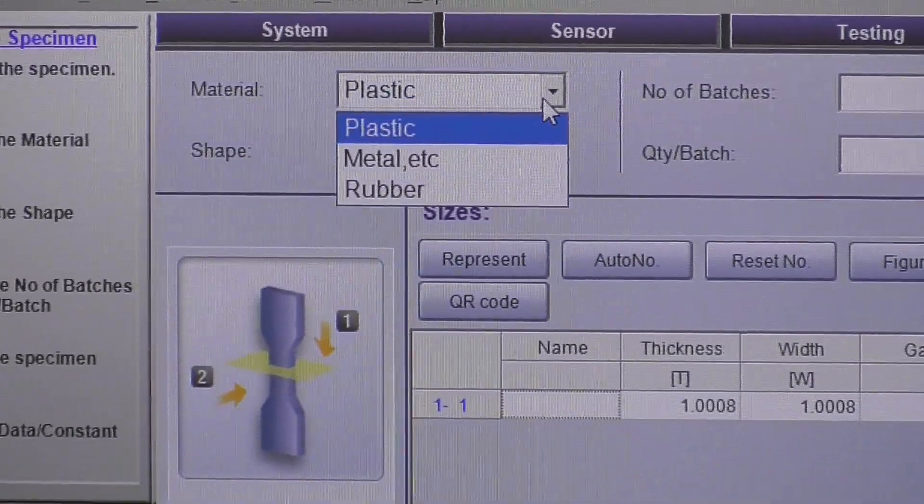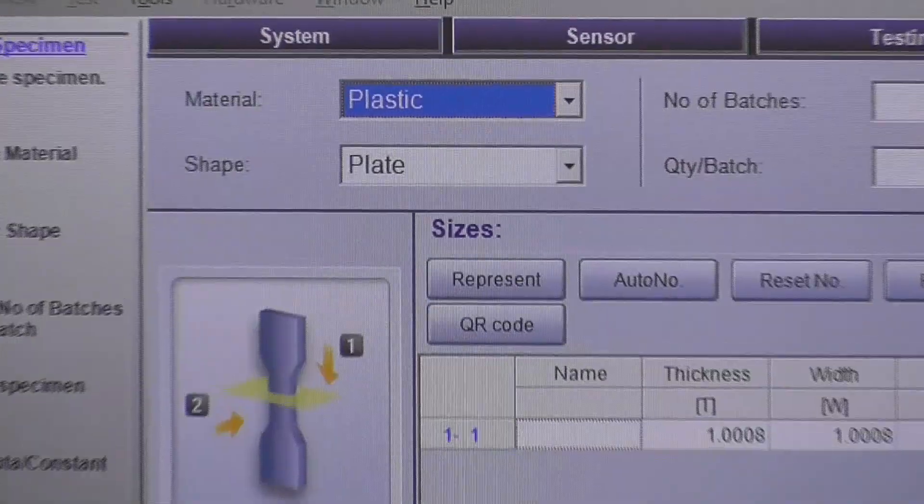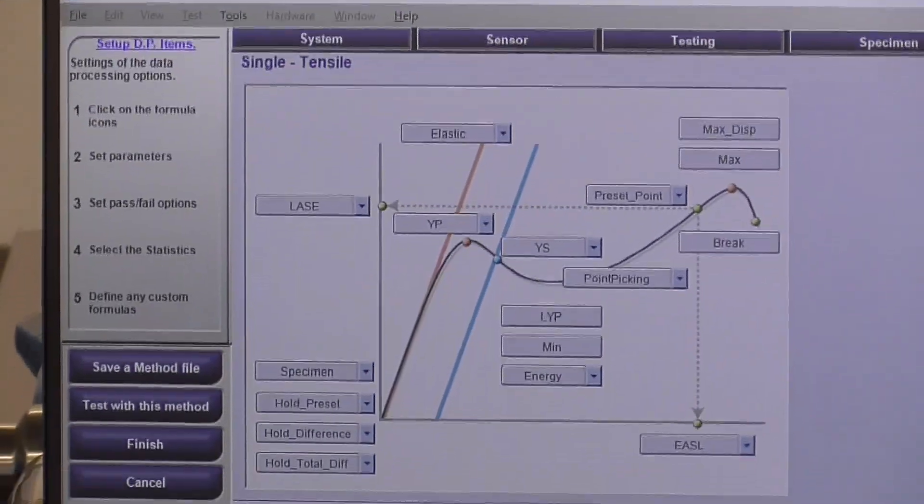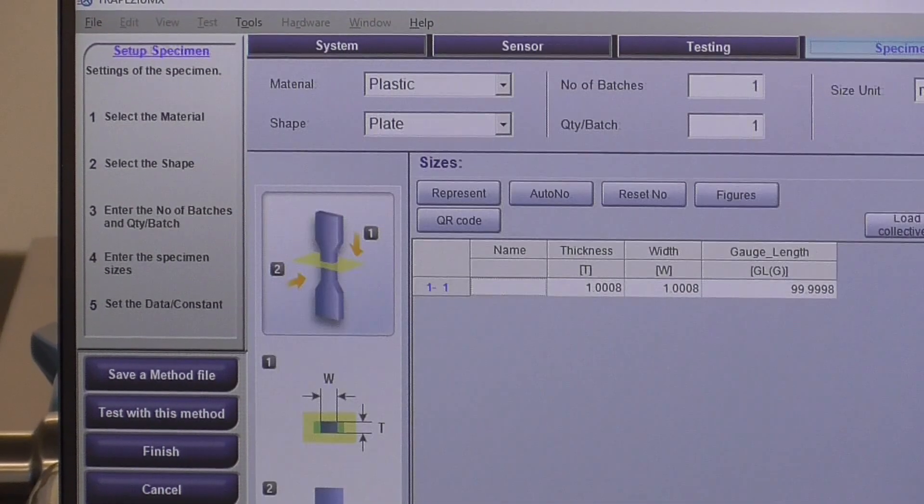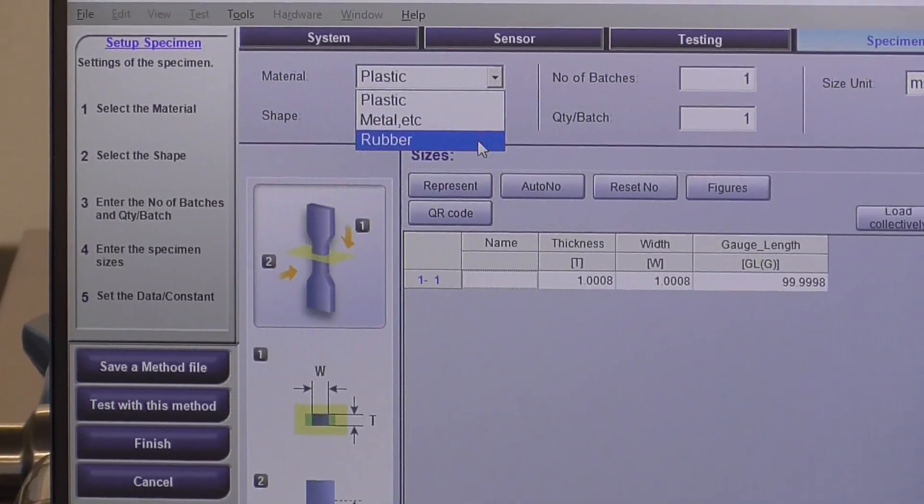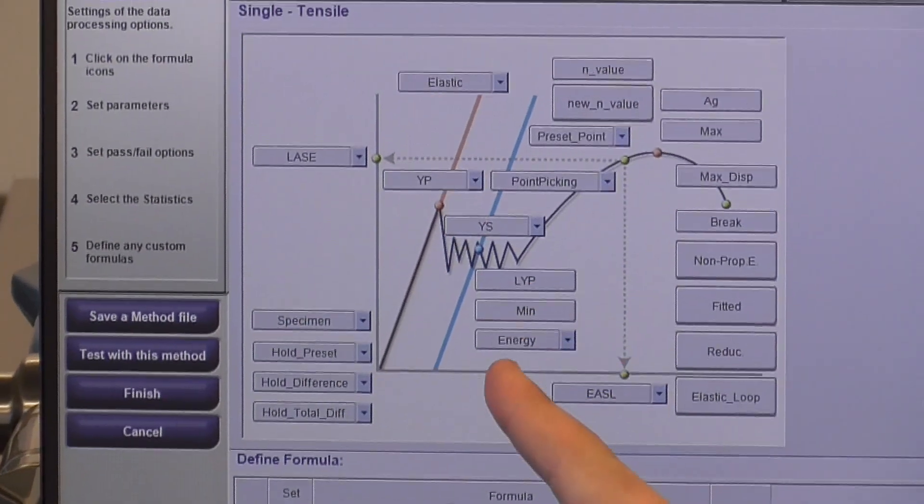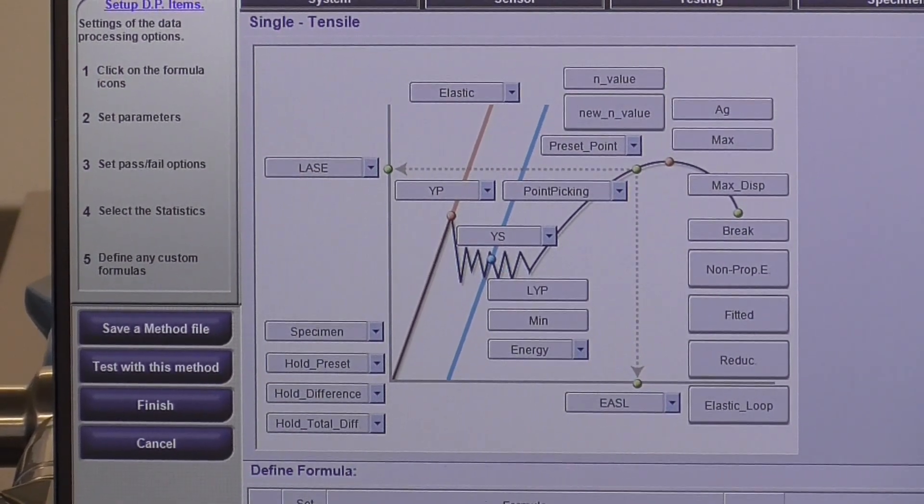For material type, you can switch between plastic, metal, and rubber. And essentially what this affects is it affects the data processing parameters which are found in your second tab. This shows a stress-strain curve that's more typical of a plastic sample. If we were to move to metal, it's going to show a stress-strain curve typical of a metal sample. And some of the data processing parameters are also specific to that material type as well.